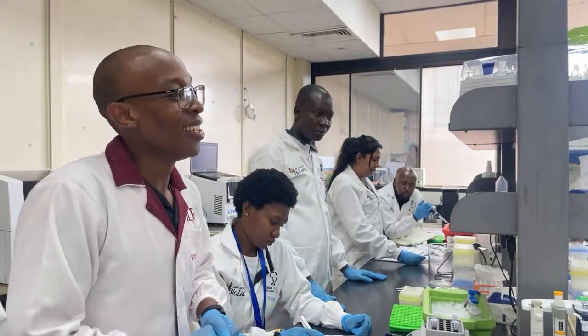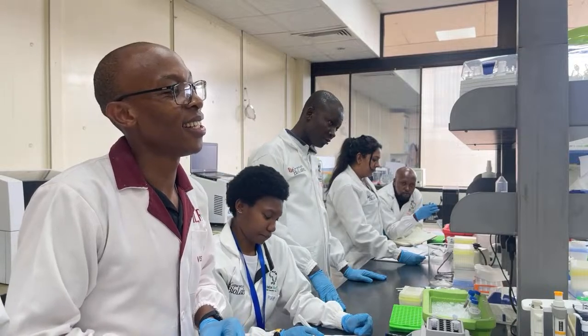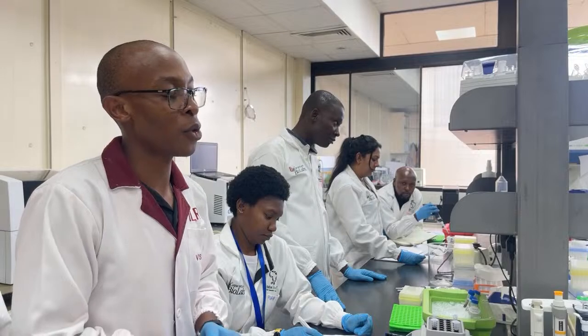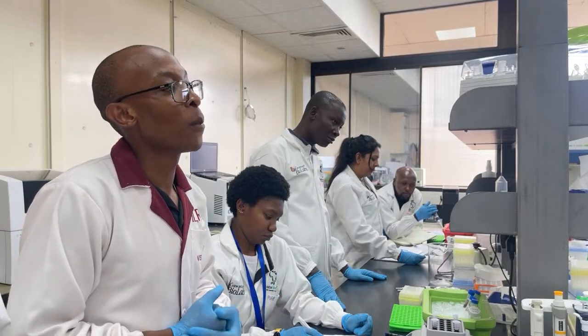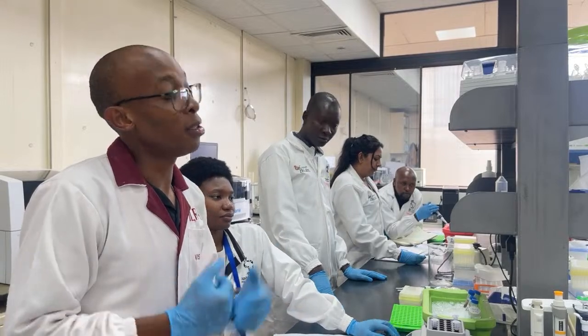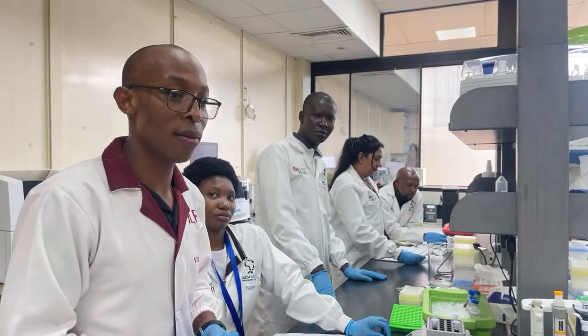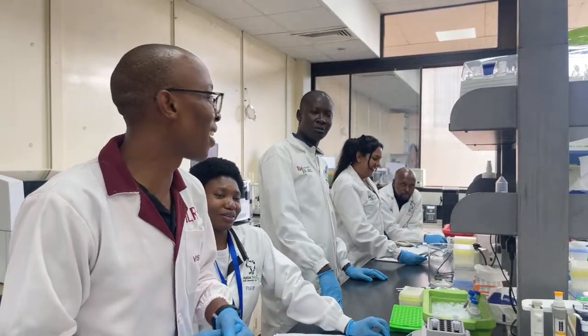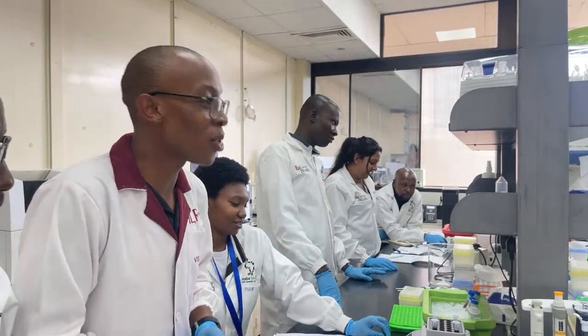Because one thing I'm sure about is that terrestrial organisms and marine organisms are totally different. They are for sure. And one protocol cannot be used for both, even if they're all animals. I can't speak for the manufacturer. I don't know what goes into that, unfortunately.